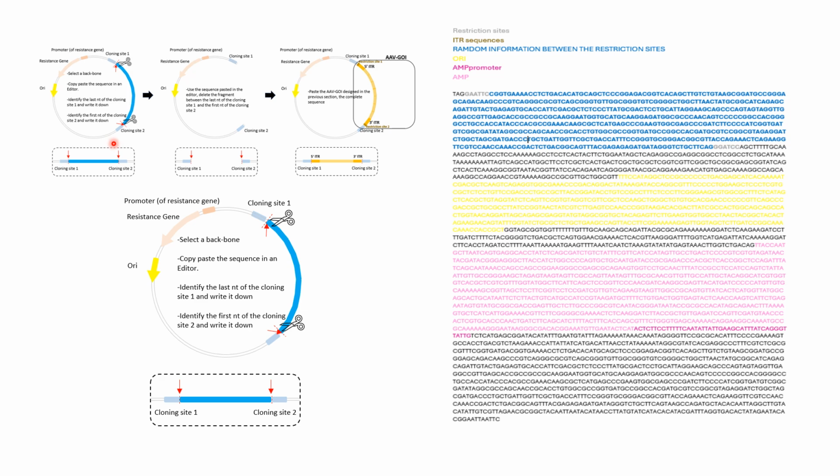Okay, so remember what we are going to do. We have the backbone with the random sequence, and what we are going to do is just delete in this region this random information, as you can see here, by pressing the delete button. And afterwards, we are going to copy paste the genes of interest. In this case, the OS genes inside here. Okay, so this is the first step.